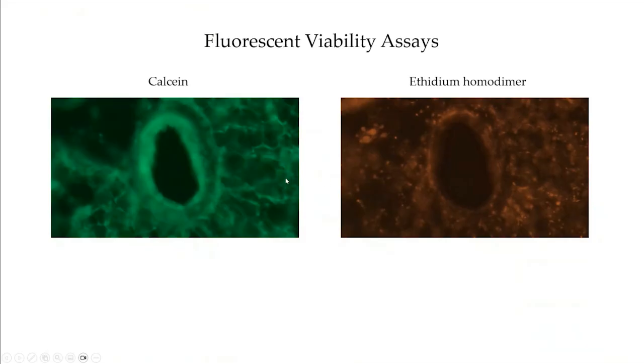Because sometimes, for whatever reason, you may not have contractility, and then you'd want to ask, are my slices even viable? Are they dead? You'd conduct an assay like this if you didn't have contractility, just to see if your slices are still viable. If they are viable but non-contractile, then it could be your beta-methylcholine was improperly prepared. It's old, or there's a problem with the chemical that's being used to stimulate contraction.